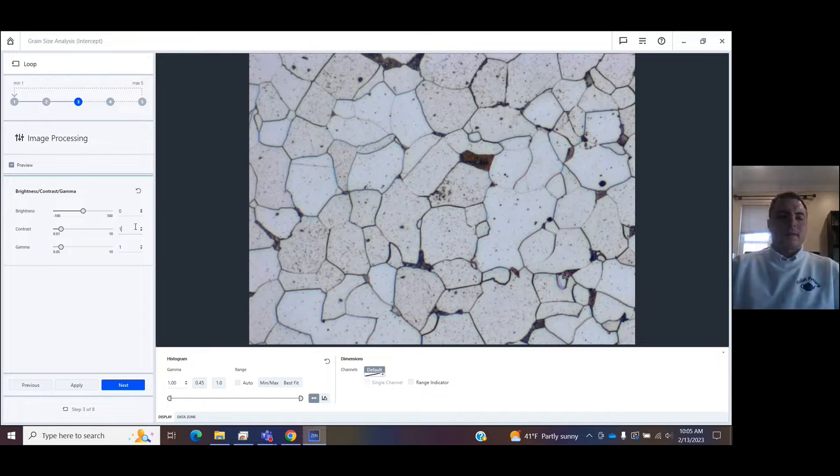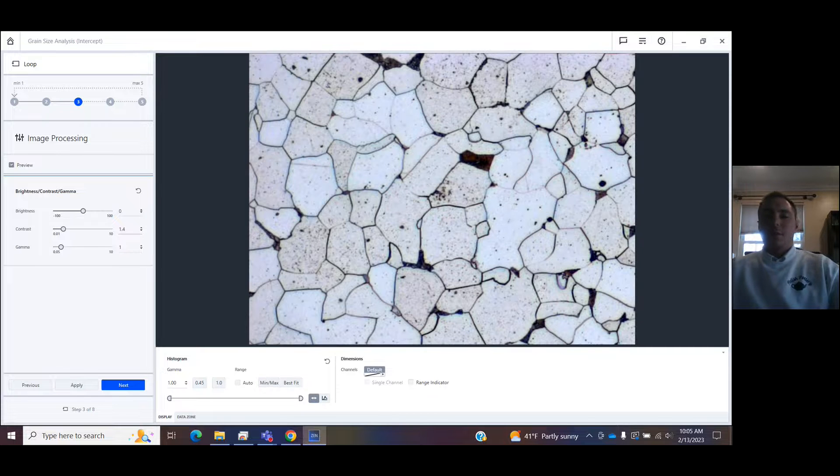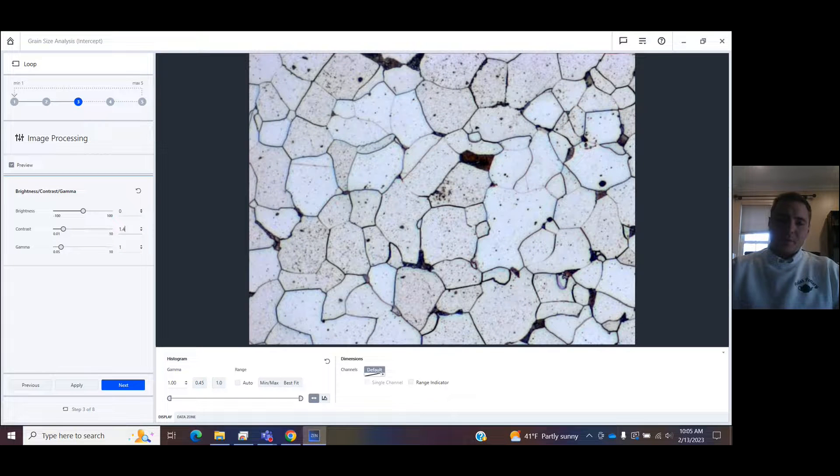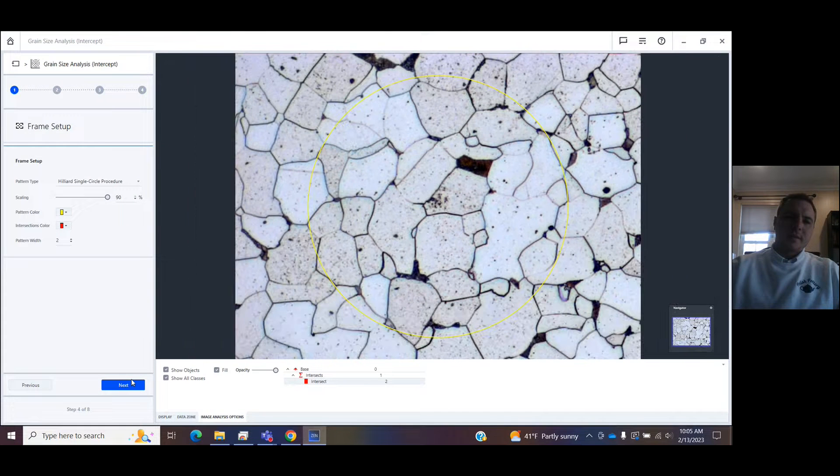You're taken to an image processing step where you can add contrast before measuring. That's just to bring out those grain boundaries more perhaps. I'll click next.